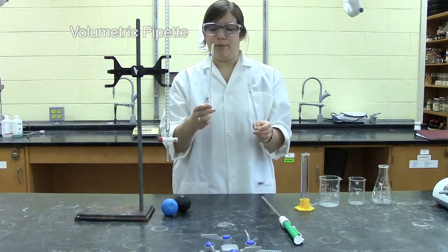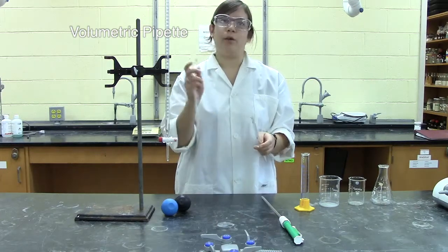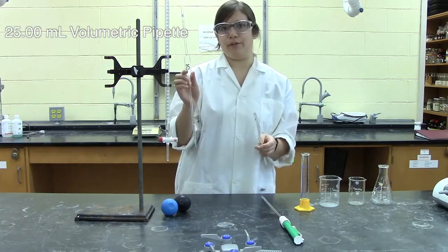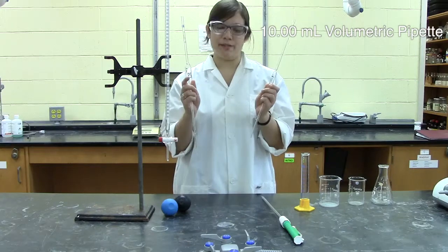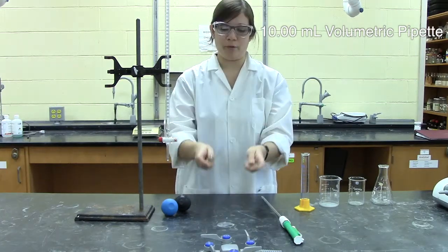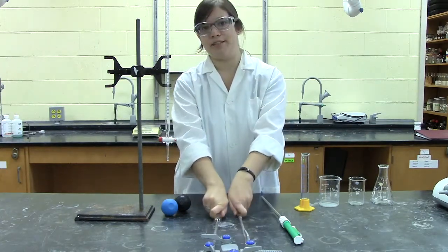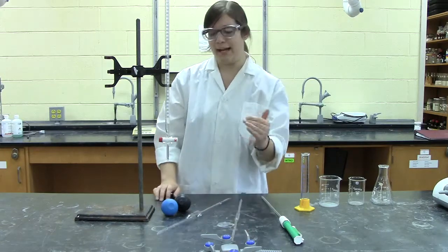Next we have volumetric pipettes. There are two in your locker. One reads to 25.00 milliliters, the other to 10.00 milliliters. They're good for making repeated measurements of the same fixed volume when you need exactly that amount.